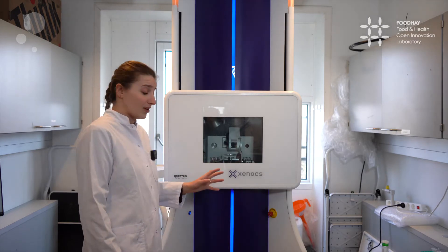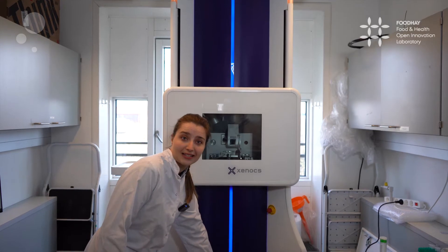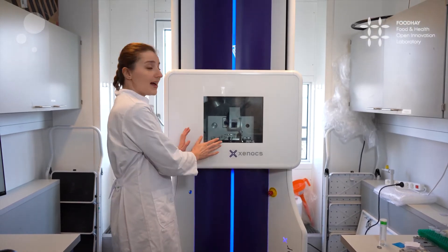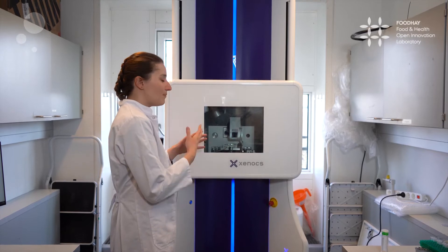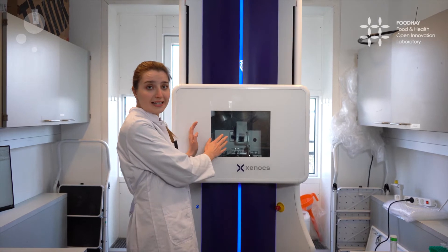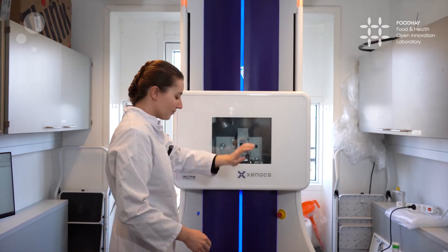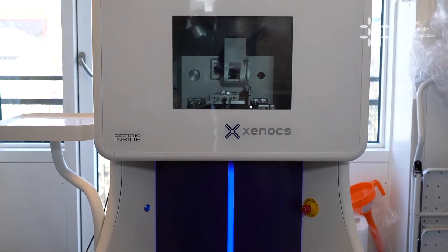It is built up by three parts. Here at the bottom is where X-rays are generated. Through the collimation, the X-rays are fine-tuned and introduced here at the sample stage, where they meet the sample and they scatter. The scattered pattern of X-rays is detected by two different detectors: a wide angle scattering detector located right here, and the small angle scattering detector located on top of the equipment. The blue line alongside the equipment shows the way that the X-rays travel.